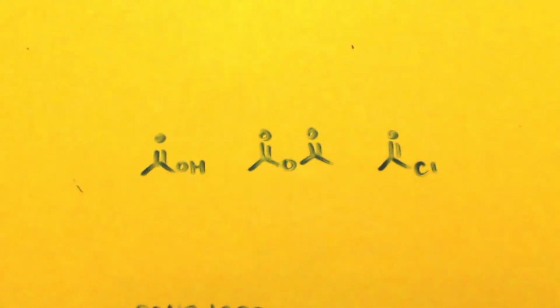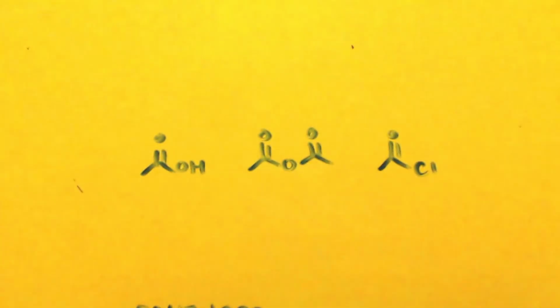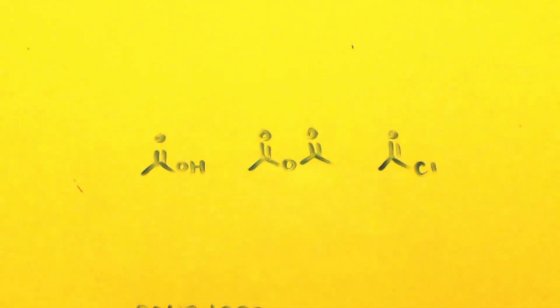Now I keep saying anhydrous acetic acid. And what I mean by that, I don't mean glacial acetic acid where you took all the water out. I'm talking about acetic anhydride. Okay, that's when you link up two acetic acids together. That's the anhydride. That's what I mean when I say dry or anhydrous. I really misspoke there. This would be the best stuff to have, because from this you can make anything below it, or any kind of acyl transfer.